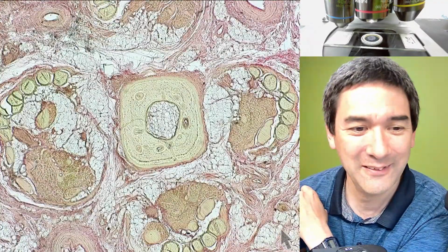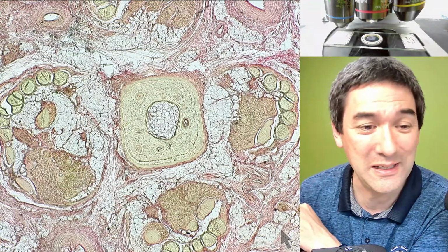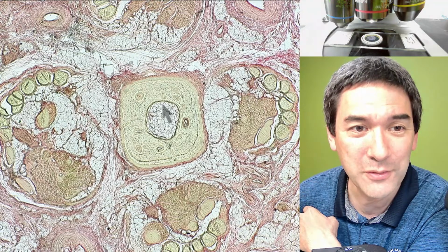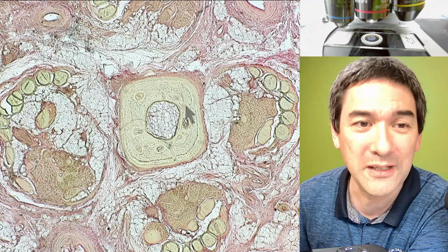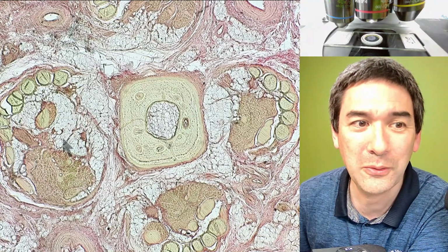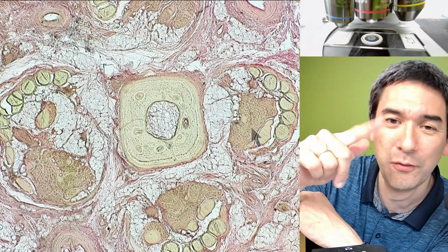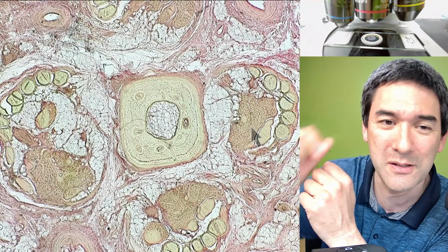Again, this is one of the nice examples that if you don't know what it is, it's who cares, right? But actually, if you know what it is, it's very interesting. So, for example, this here is the bone of the tail. You've got the bone marrow in between here. Here, that's 1, 2, 3, 4 muscle bundles. Basically, a pair of muscles moving the tail like this, the other pair moving it sideways, because muscles are able to pull.